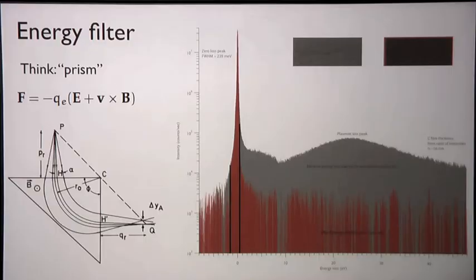Shores told you yesterday that the inelastic electrons basically cause damage but don't give us imaging capability. And so for thick specimens, like the kind you would use for tomography, this can be particularly useful, because if you just clip off right around the primary beam here and get rid of all of these inelastically scattered electrons, you do increase the contrast in your image. This is just a carbon film, and this is with and without the energy filter turned on.